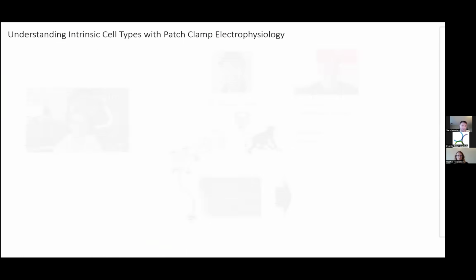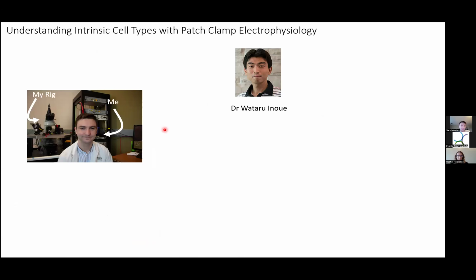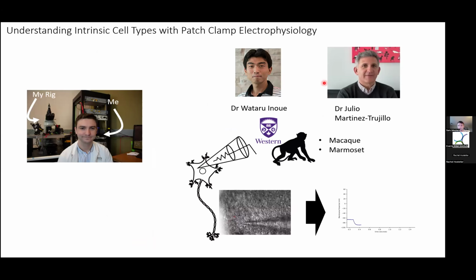So talking about the motivations, I want to first say that my day job is a patch clamp electrophysiologist. There's me sitting happily in front of my rig. I study under Dr. Wataru Inoue, and through close collaboration with Dr. Julio Martinez Trujillo, we've been able to record from NHP cortical cells here using patch clamp electrophysiology. Here is an example of me patching a cell. This is supposed to be a video of me trying to suck the nucleus up, but the video is not working. And here's an example electrophysiological waveform of one of the cells.